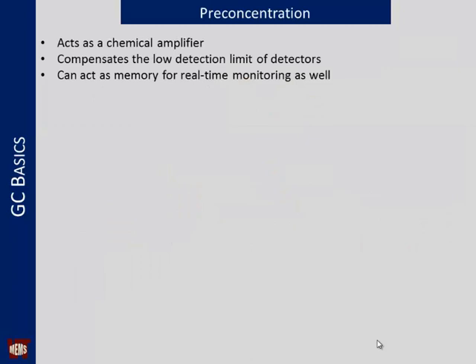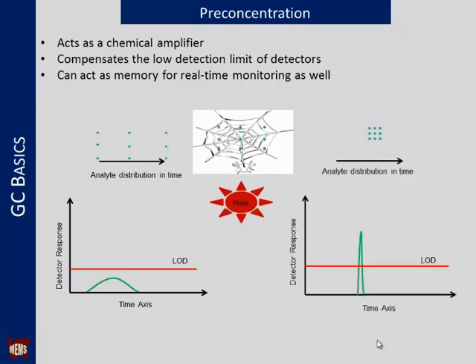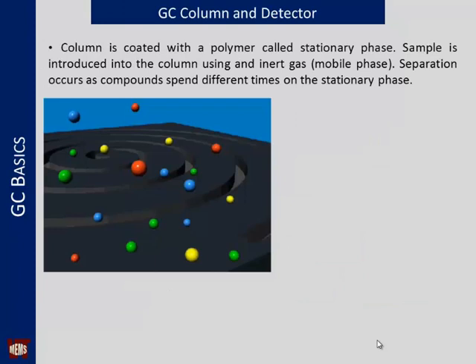So what is the role of a preconcentrator? The preconcentrator acts as a chemical amplifier. If the concentration of the compounds in the environment is pretty low, then you're not able to detect it with your detector. So you trap the compounds as they pass over this chip or unit, over a period of time. After you have collected enough, you apply heat, which releases the compounds and creates a concentrated plug. It goes through the detector, and you can detect it as it is above the detection limit.